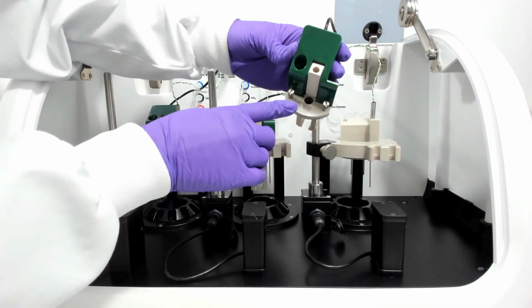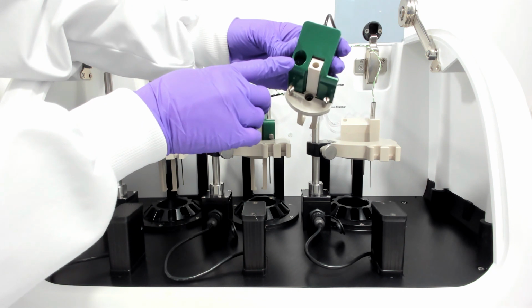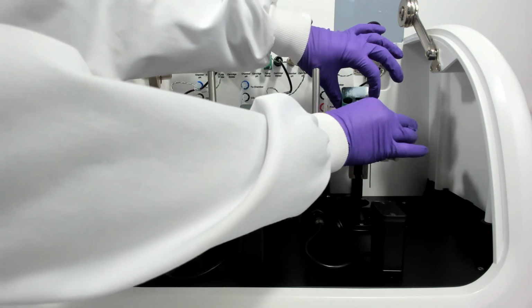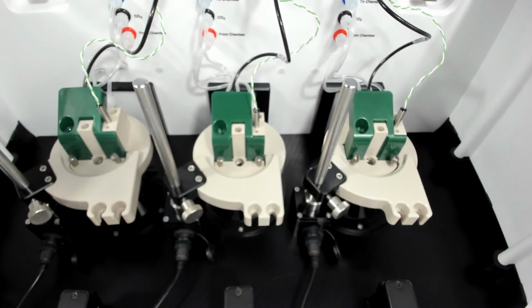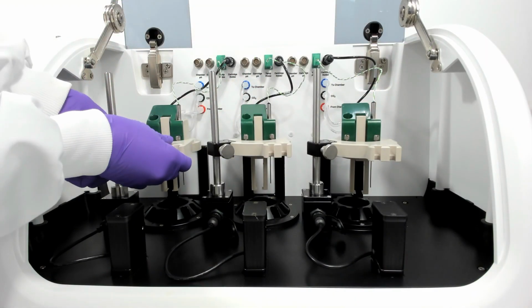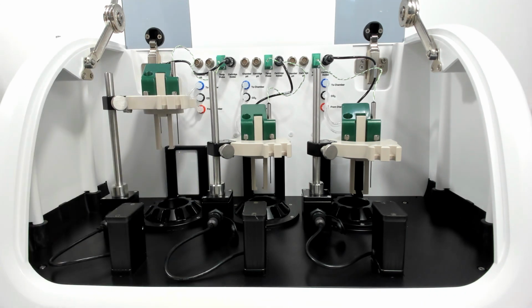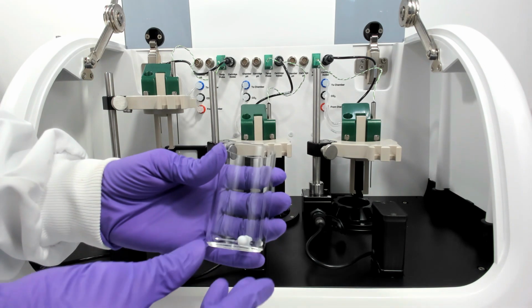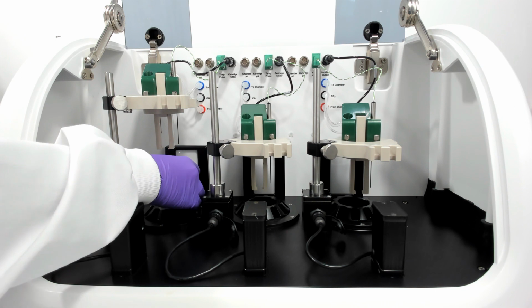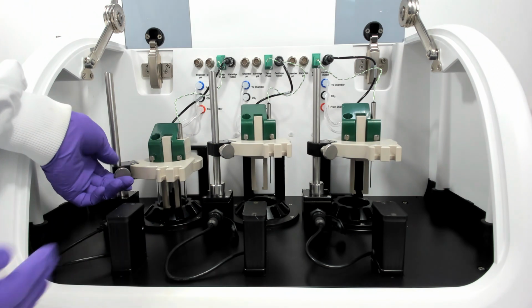Here we have the port where we inject our sample, the port for our cartridge electrode, and our chamber electrode. For ease of use, everything is in one position and we can just lift the chamber lids up to get hold of the items underneath. This is the small vessel size. This is a small chamber at 60 milliliters in size, and we can just lower our chamber lid straight into that vessel.